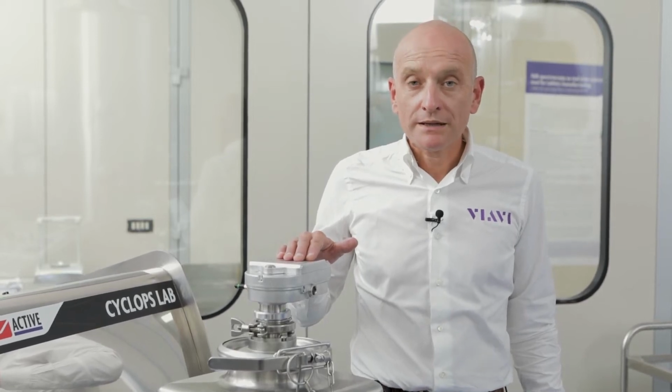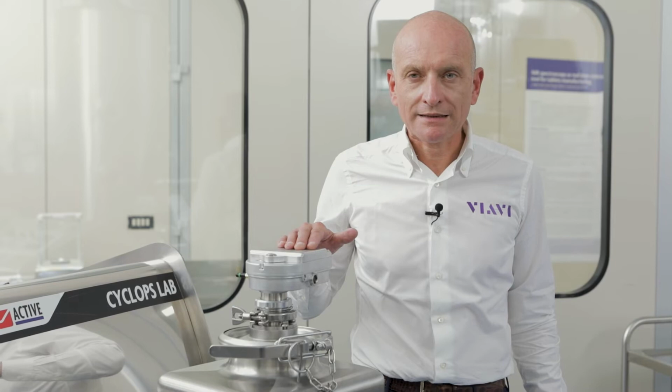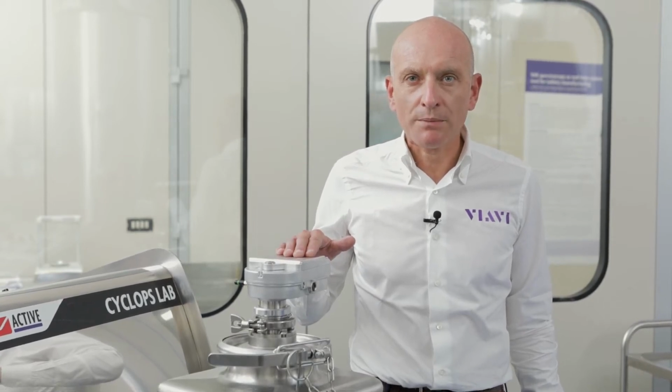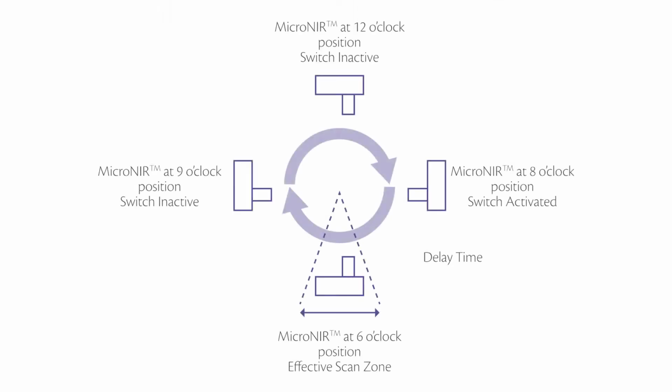On top, the device has a gravity sensor that we will see in a while how it can be set, and also it has an embedded computer that is very important in case of Wi-Fi outage to keep the data stored in the proper way and therefore for data integrity. As I just said, the PAT-W has an integrated gravity sensor that enables the trigger only when the product is in contact with the window.